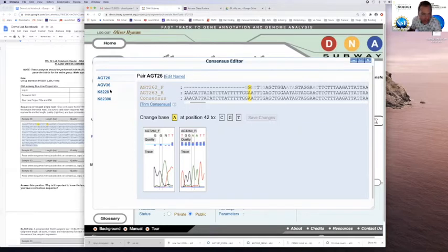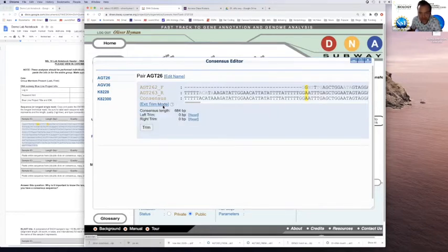So for each of your sequences, let me go through the rest of the way on this one. The other thing you can do with this is what's called trim your consensus sequence, okay? So best practices say that these tails, where there's no overlap in the sequence, we can't necessarily trust them because we don't have a double check for those regions. So you'll tend to have a little bit of tail on the reverse end that's not overlapping with the forward read, and a little bit of tail on the forward read that's not overlapping with the reverse read. And so these tails you can trim off.